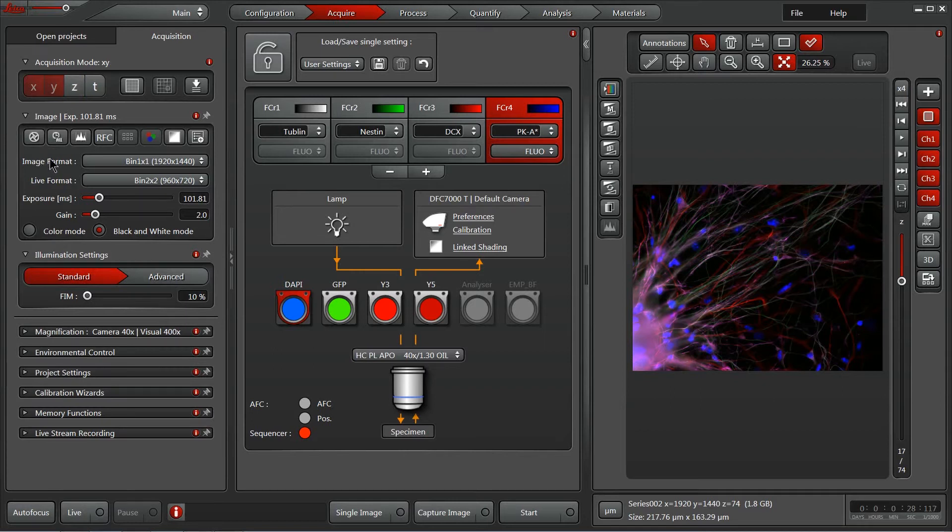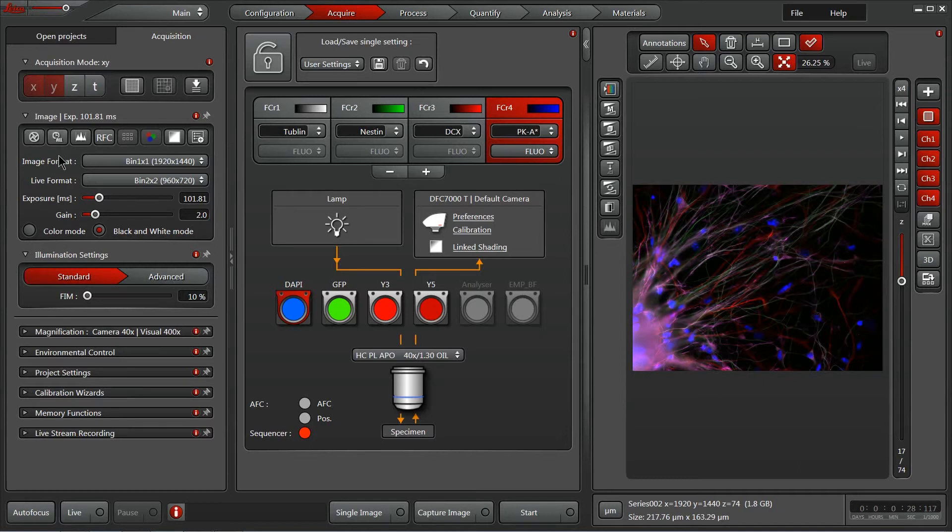Beneath that we have our imaging control window where our camera's exposure time, gain, and settings can all be accessed. These can be either identical across multiple channels or customized for each of the channels that you've set up.